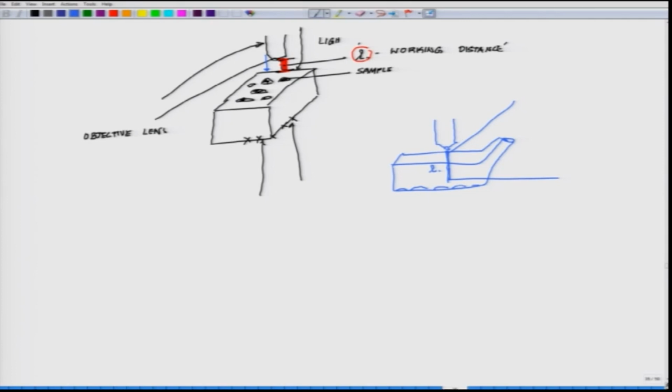But since it is a T25 flask, I will come to the other side very soon, you do not need the upright in that case. But since your substrate is opaque, it is not allowing any light to come from the bottom, your only option is to use an upright objective in that situation.